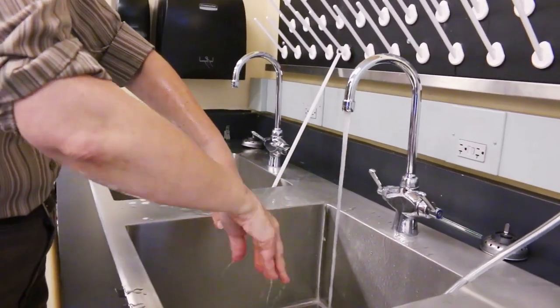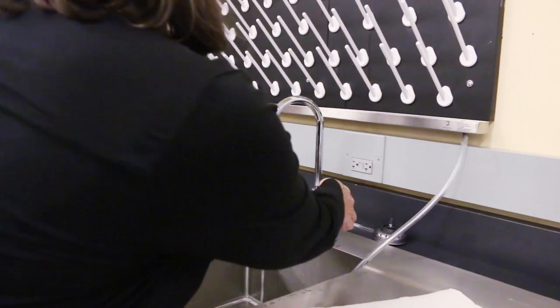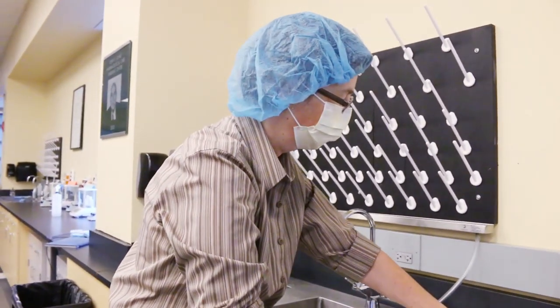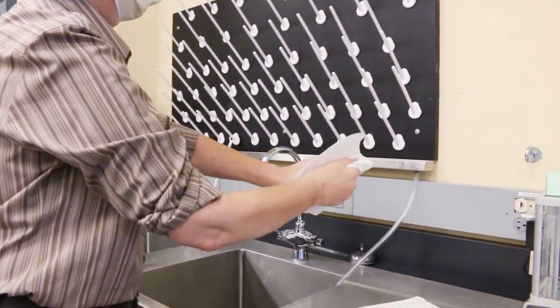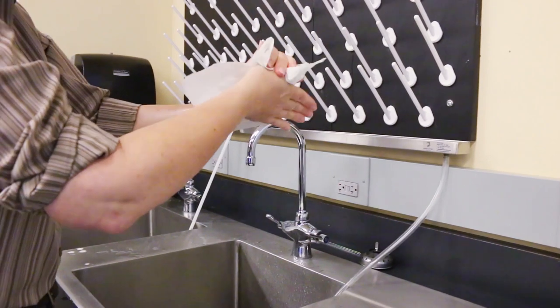When rinsing is complete, ask the judge to turn off the water. Turn off the water, please. Step 18, using an aseptic lint-free paper towel, dry both hands moving from fingers toward your elbow. Dispose of the paper towels in a waste container.